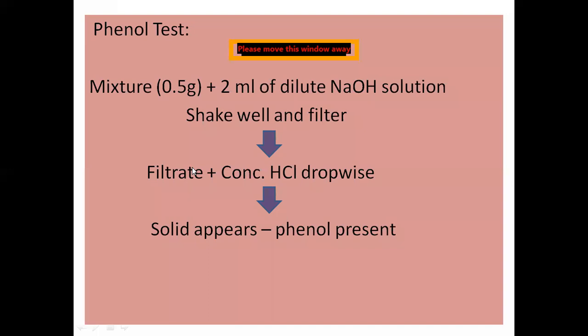So water soluble might be acid, because they will not give water soluble phenol or water soluble base. Generally they provide the water soluble acid, which is, I think, succinic acid, and one more acid which is a water soluble acid. So here you will get the solid appears.